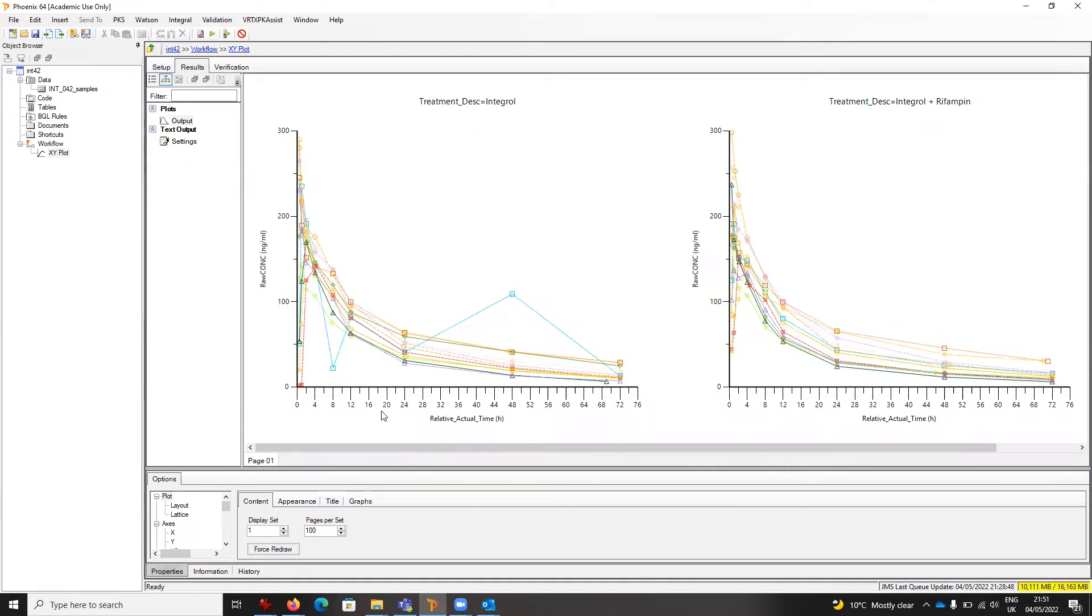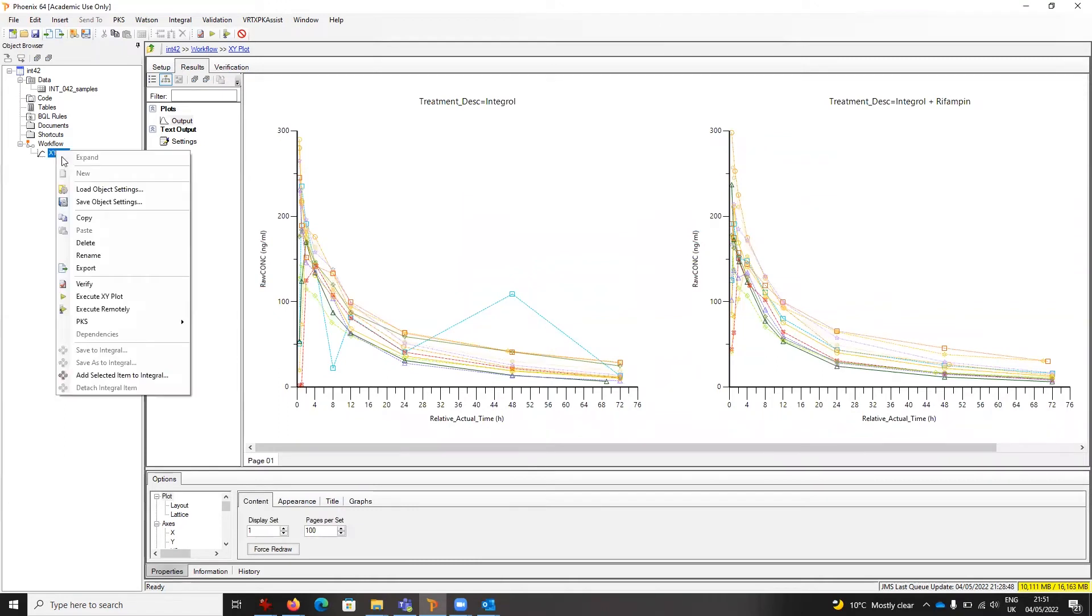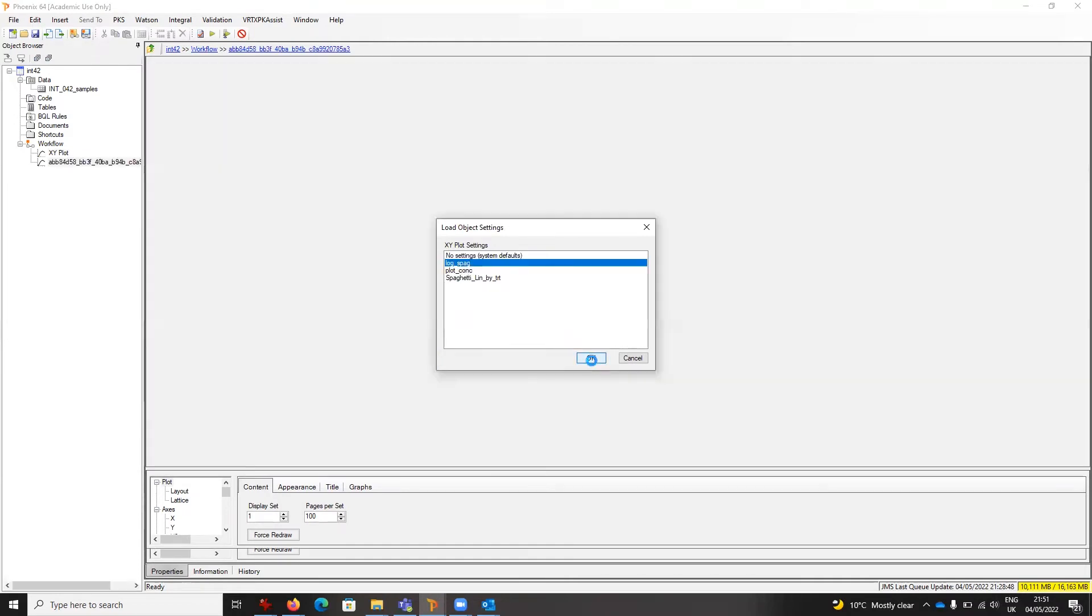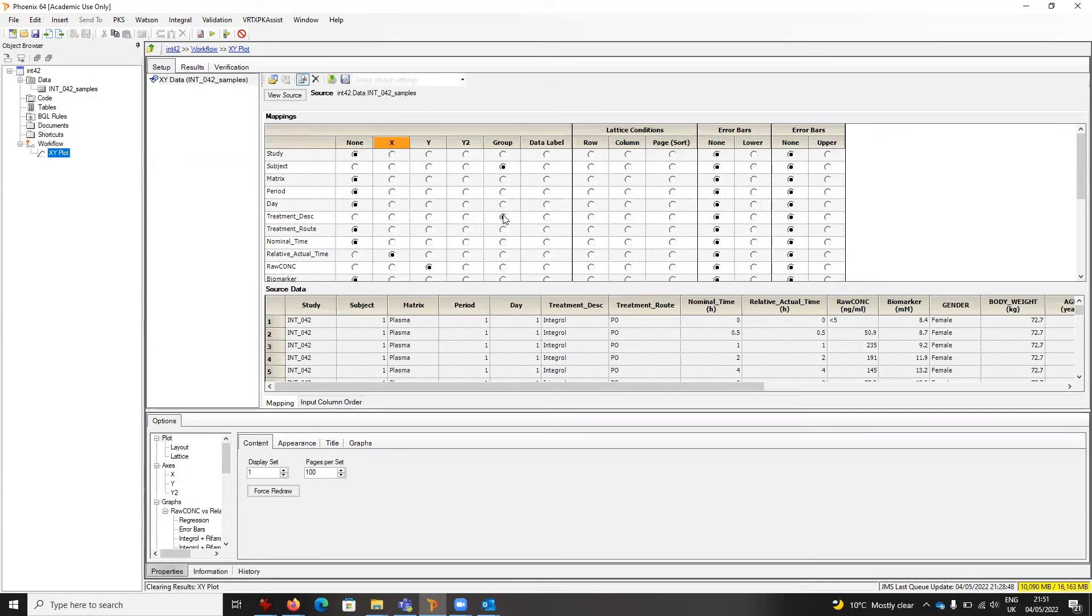I can right-click, pick up another object setting, and this time, for instance, say I want the log spaghetti and click OK. The map is slightly different now. We can see that the group includes treatment descriptions, which means I'm going to get a single plot because there's no longer any lattice conditions.